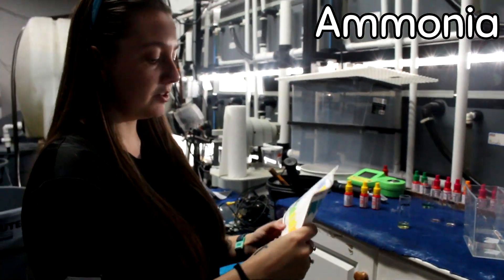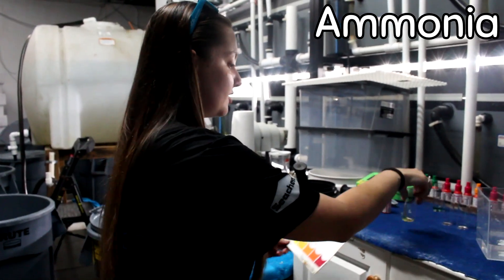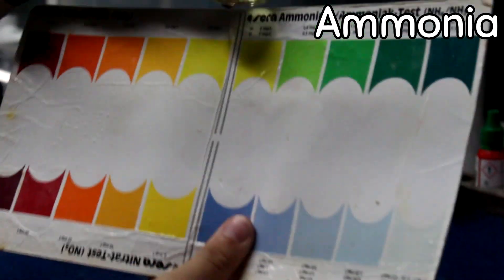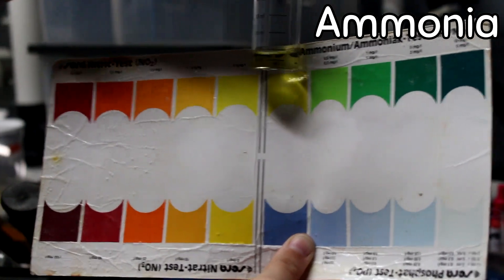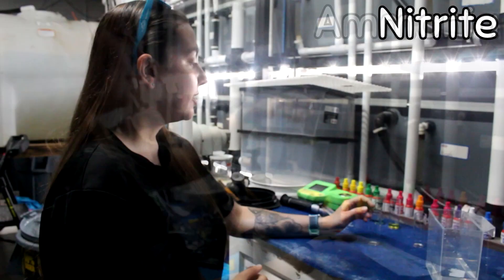For your ammonia, you want zero — you don't want any ammonia in your tank, it's very toxic for your fish. The ammonia color will show up at the top of the vial. Mine's light yellow, which is perfect — that means I have zero ammonia in my tank, which is exactly what you want.